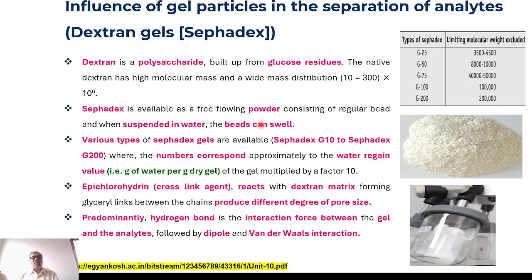Usually Sephadex is available as a powder. And when you soak this Sephadex powder in buffer or in water, exclusively buffer is preferred, it will swell, so that you will get a bead or gel-like architecture.